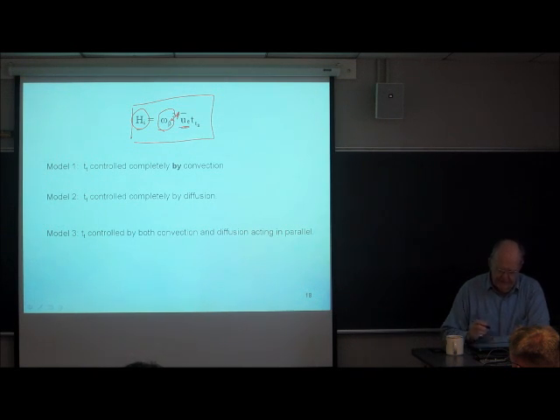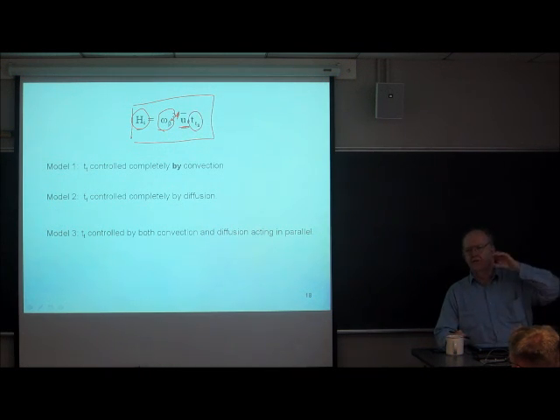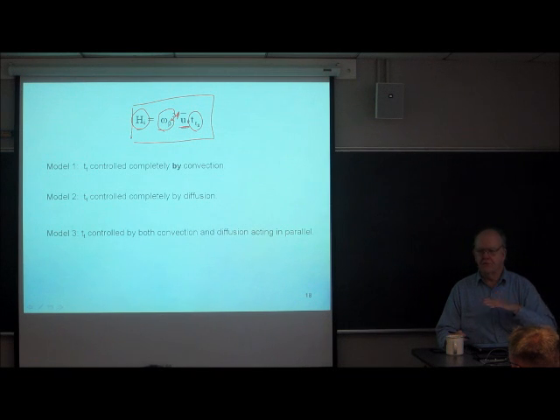Times the average interstitial velocity times the time it takes for a solute molecule to get out of whatever flow stream it's in and over to a flow stream that has the average velocity.